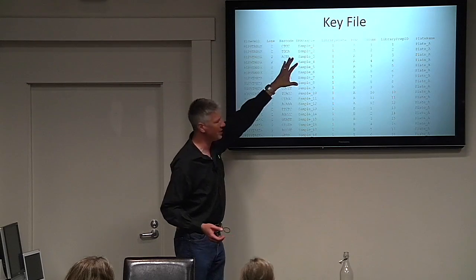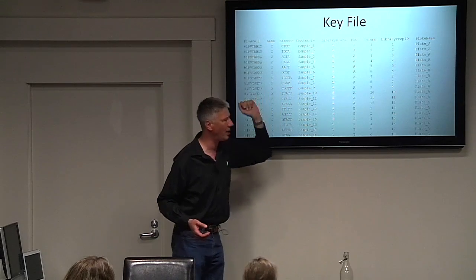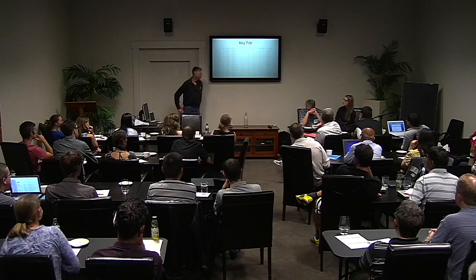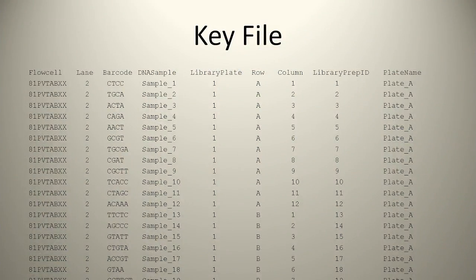And we can get into details about naming things. Actually, Katie, do you want to do that now? Yeah, I'll just say, because it's not in a slide anywhere, a lot of times people submit things that are either technical or biological replicates. And if you think at some point down the road you want to merge that data, in this particular spot where it says DNA sample, when you're submitting your spreadsheets, if you're submitting to IGD, make sure that those samples are named the same. Because with all the other information that's there, we're going to know which one it was, so it can be separate if you want it to, but if you want it to come together at some point, you have to name the samples the same, otherwise it's a really big pain in the butt, okay? Because that's putting it lightly.